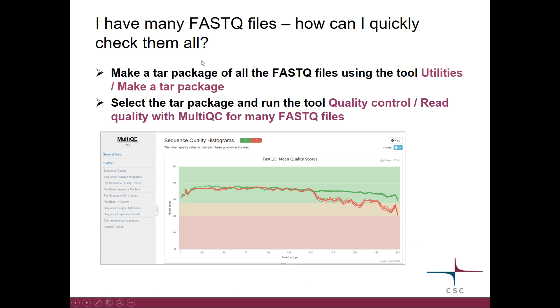You would use the FastQC tool if you have a couple of files. But if you have many FastQ files, it can be painful to run it individually for each file. One quick way would be to use a tool called MultiQC. What it does is run FastQC behind the scenes but then combines the results in one plot. It takes a TAR package of files as input. There is a tool in Chipster called Utilities Make a TAR Package — you take all your FastQ files and run this tool, then give that TAR package as input to the quality control tool: Read Quality with MultiQC.